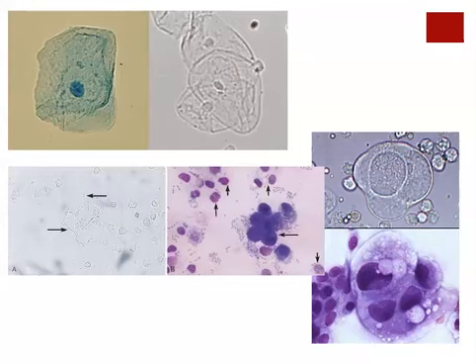Now let's take a look at the pair of images in the middle of the slide. On the left-hand side, I think you'll agree it's pretty hard to see much of anything, although you are looking at a smear of blood cells over here, white blood cells particularly. Now if you look very carefully, you can see these little circles here. Those are the nuclei of these eukaryotic cells. But boy, it's hard to see individual cells over here. And that's because this preparation has not been stained.